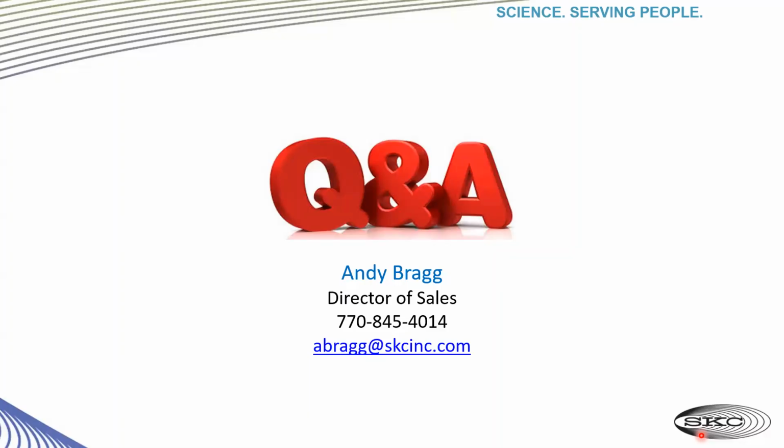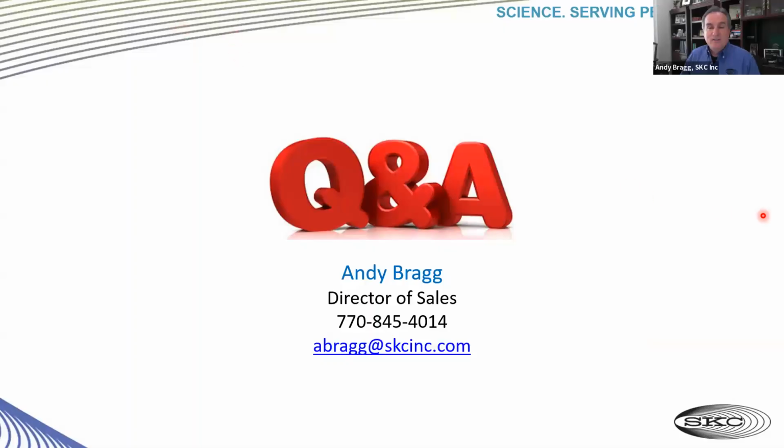Okay, great. Thanks, Andy. It looks like we have about 4 or 5 minutes left for questions, so I'll jump right in. The first one is, doesn't loading the filters yourself potentially add to the SAE? Dusty, is that a good question for you? I don't actually know the answer to that question. That would be a really good question for one of our lab partners, about what influences the SAE of the given samplers.